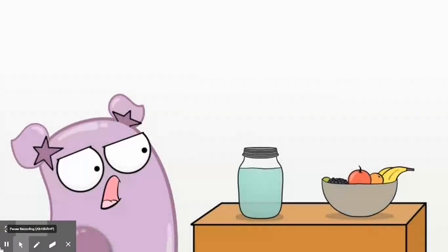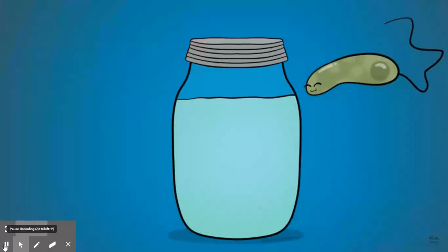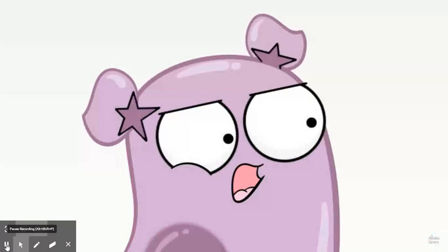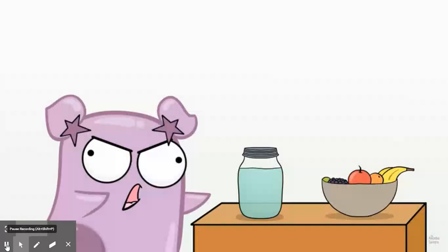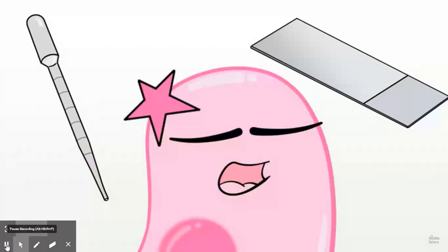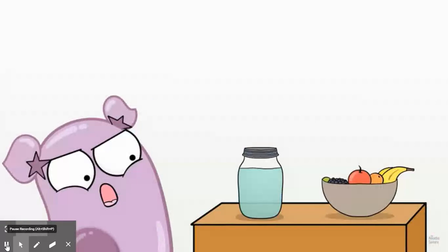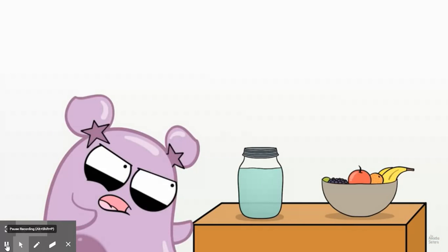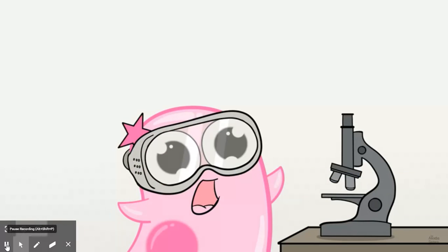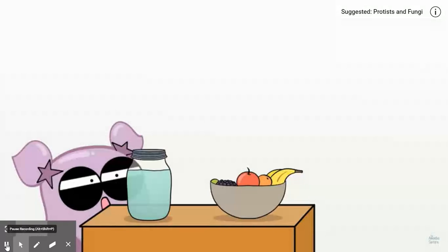Pinky, what is on the kitchen table? Oh, it's my protist. I'm hoping to find some euglena and maybe some paramecia. I took the sample from... Why is it on the kitchen table? Oh, I got distracted. I was going to take some drops and put it on the slide while I set up my microscope. Yes. Well, please get your green water away from where we eat. Green water? Don't be ridiculous, Petunia. There are tons of protists in here. We just have to find them. Well, you're out of luck.